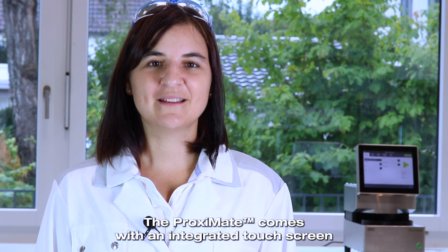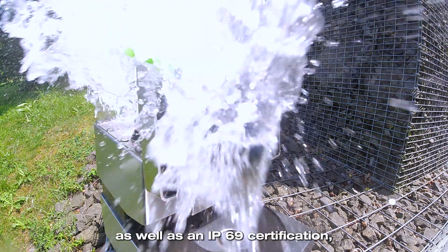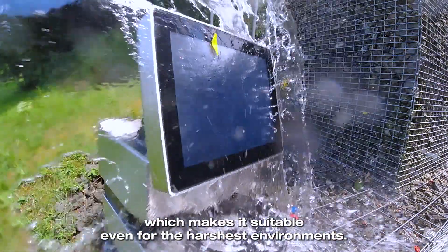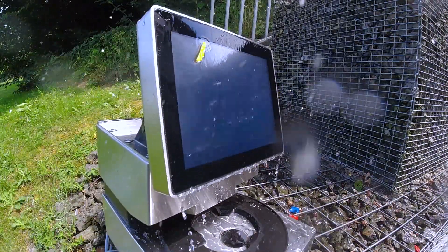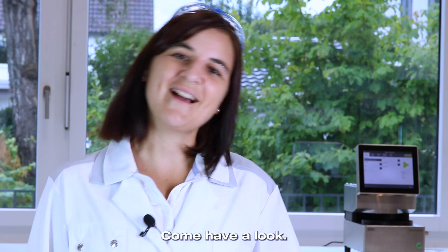The Proximate comes with an integrated touchscreen as well as an IP69 certification, which makes it suitable even for the harshest environments. On top of that, it's super easy to use. Come have a look.